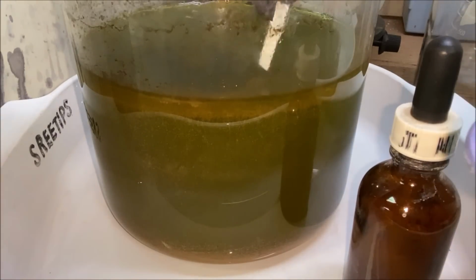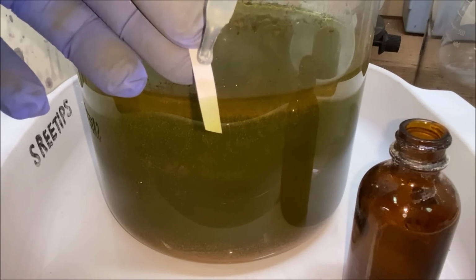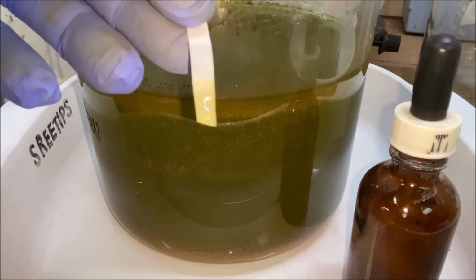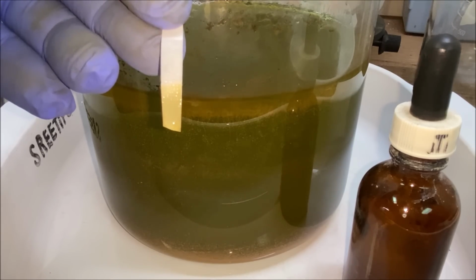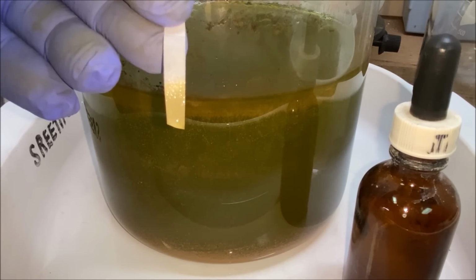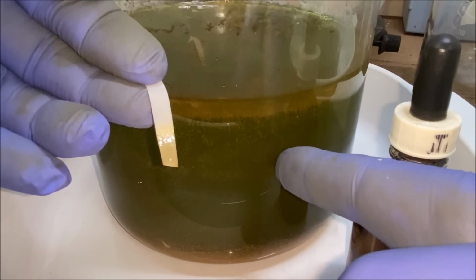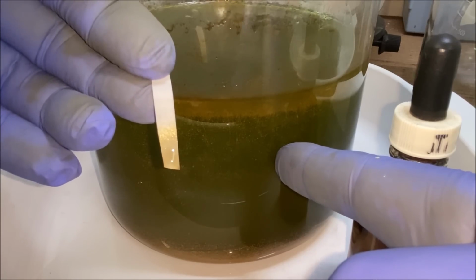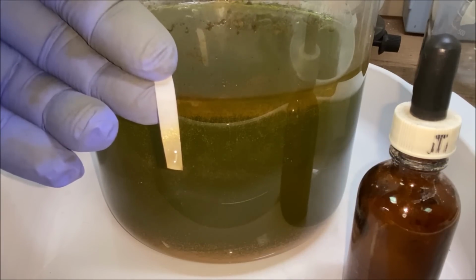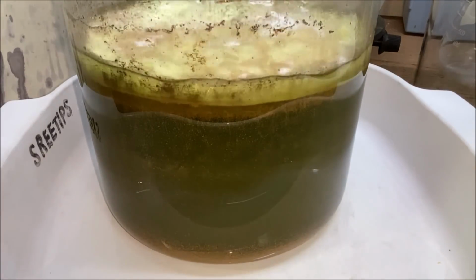Alright, let's do another stannous test. Let's see if we got all the gold out of there yet. Yeah, I think we've got all the gold. All I see is an orange stain now, which tells me the rest of this liquid just has platinum in it now. All the gold has been dropped. I'm going to stir in 1 more spoon just to make sure.